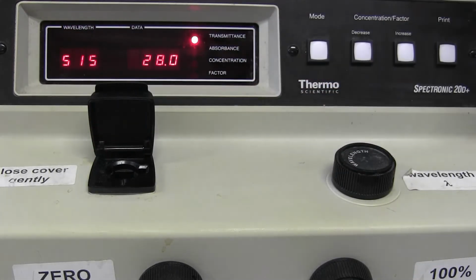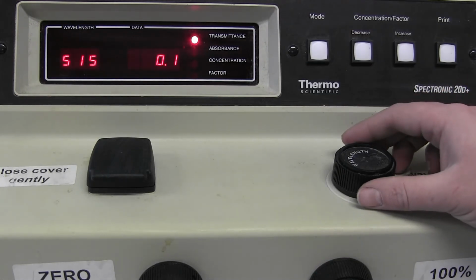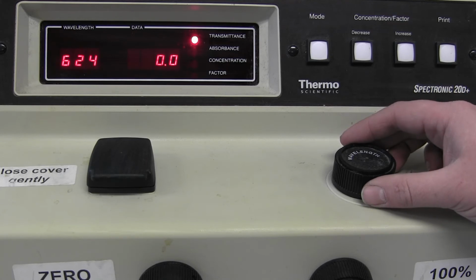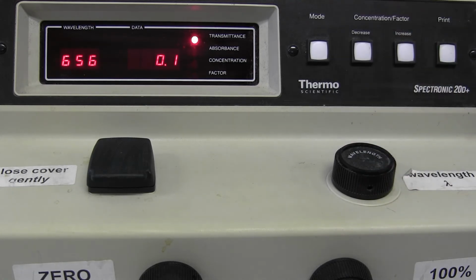Once this is done, you will then change the wavelength to 655 nanometers. Recalibrate the spectrophotometer using ethanol, and then obtain the absorbance or percent transmittance of these 3 solutions once you have the wavelength adjusted and the spectrophotometer calibrated.